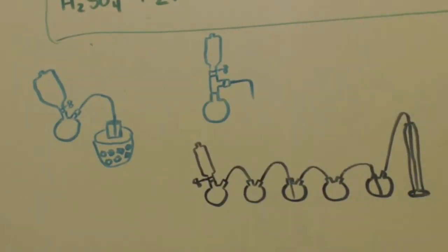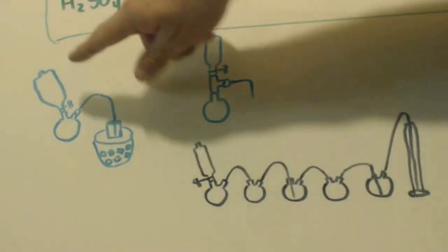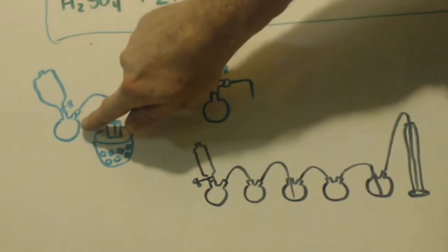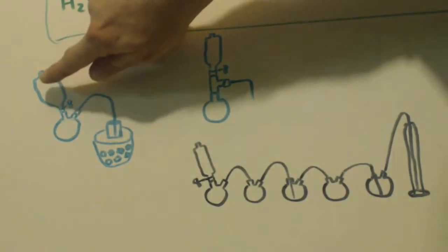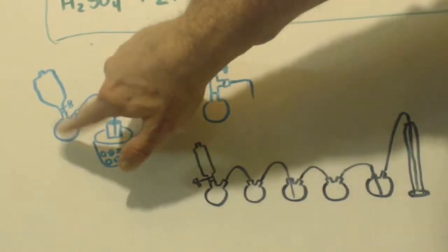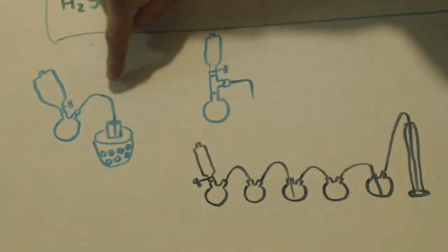Alright, my apparatus, which I'm going to show you soon, looks very complex, but it's very simple. The way you do this is you drip this acid onto the salt. So here's a separatory funnel and a round bottom flask. You drip this sulfuric acid into the table salt that's in here. It would create gas, and then you use a hose.